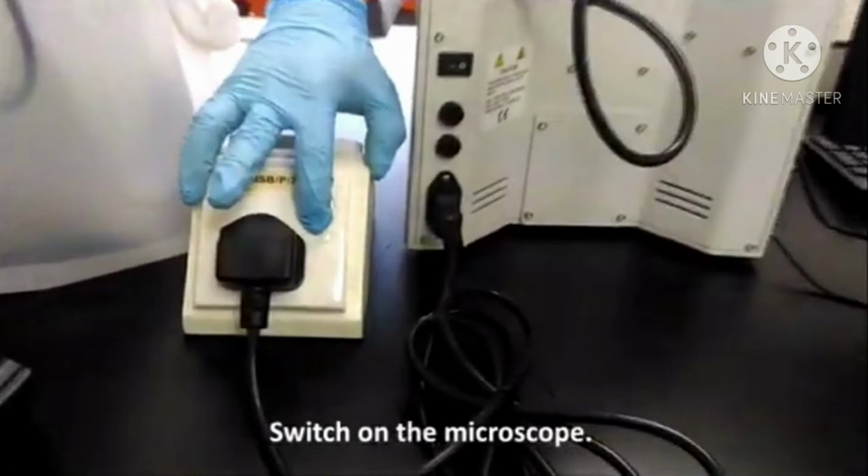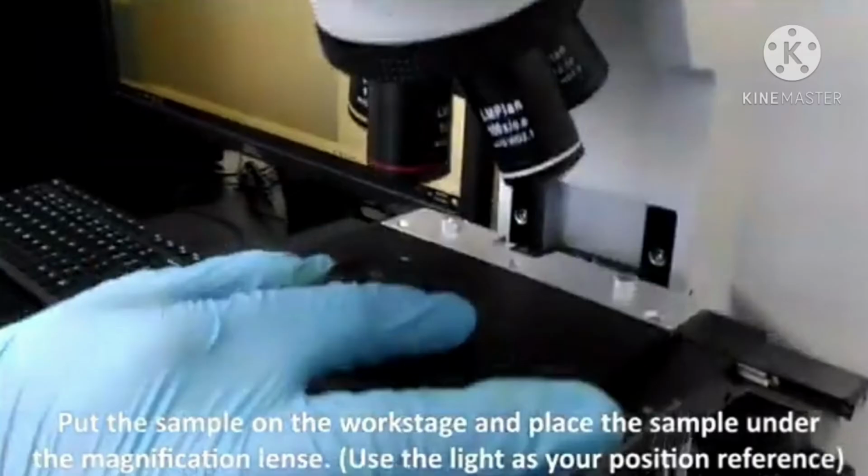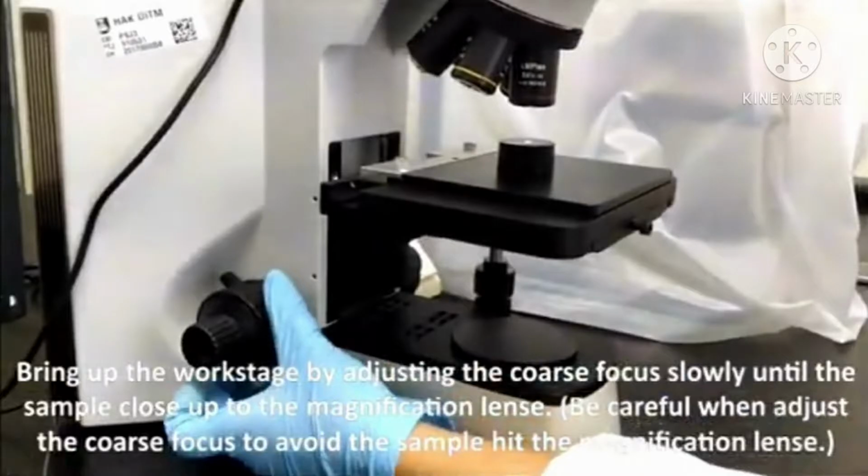Switch on the microscope. Put the sample on the workstage and place the sample under the magnification lens. Use the light as your position reference. Bring up the workstage by adjusting the coarse focus slowly until the sample is close to the magnification lens. You have to be careful when adjusting the coarse focus.